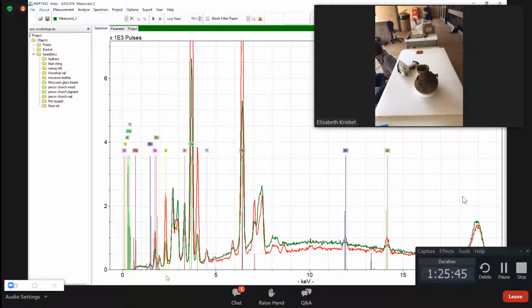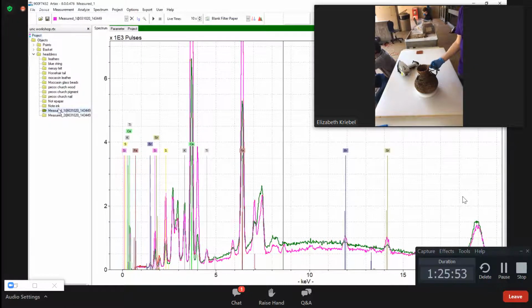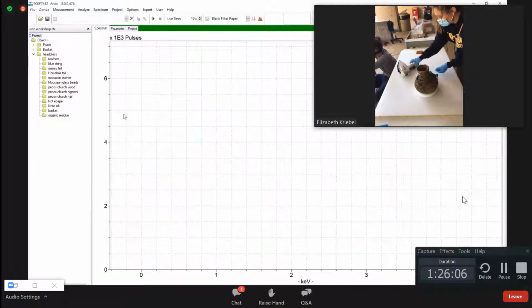Okay. Well, that's as we would expect. Yeah, and the bromine's gone. Whatever that is does not have the bromine. And I don't think we hit the strap yet, did we? We have not. Yeah, my money's on tree sap for what it's worth, but I don't know for sure.